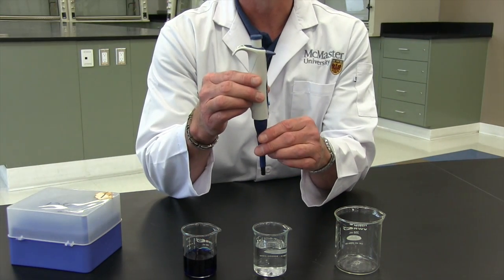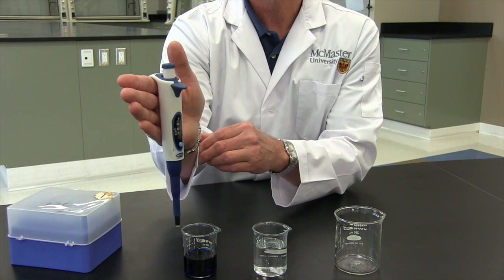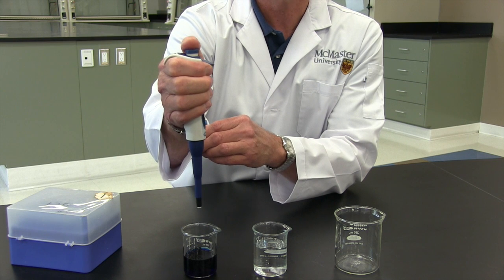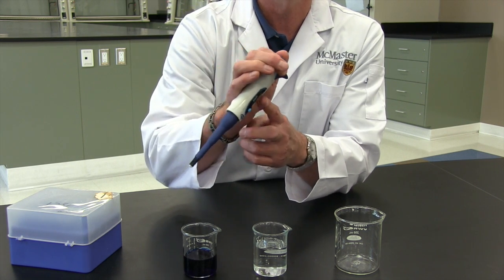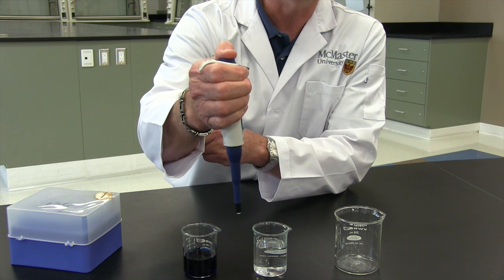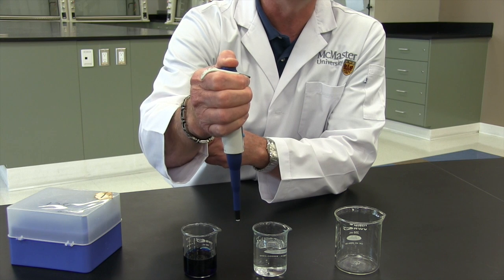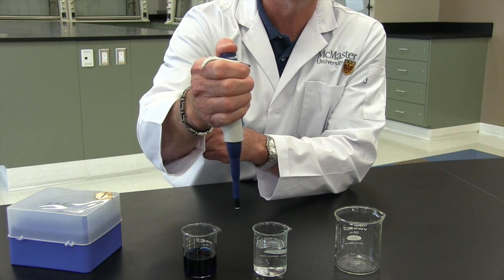The plunger within the body of the pipette has two positions. I'm going to hold it in my hand like this, wrap my fingers around, put my thumb on the cap. I'm going to press down till I feel the first resistance. That is the volume that I've set on the micropipette. When I press down to the second position, that is a little bit of extra air that helps dispense the volume out of the pipette. So first position, second position.